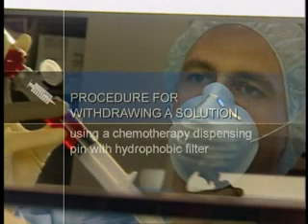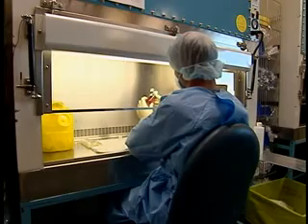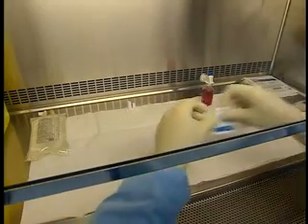Procedure for withdrawing a solution using a chemotherapy dispensing pin with hydrophobic filter. Before withdrawing, check that the powder has completely dissolved. The solution should not contain any foam or undissolved particles.